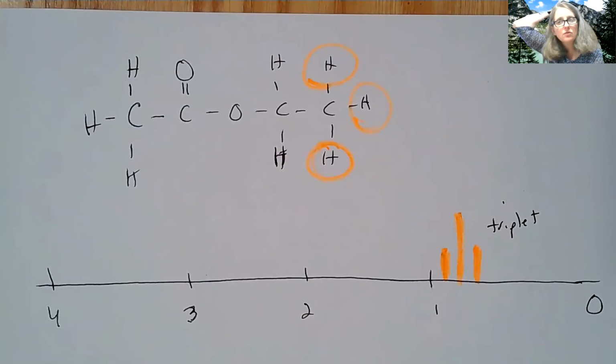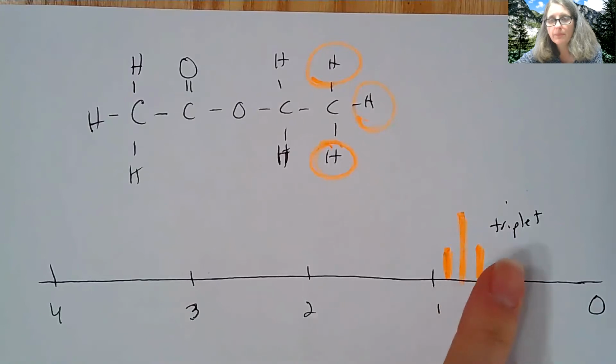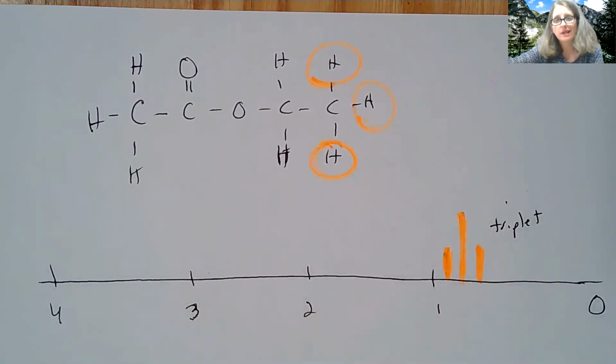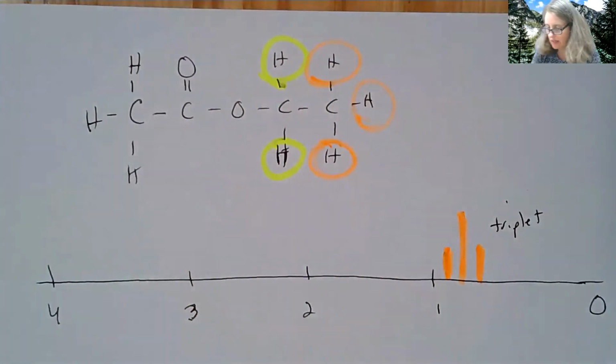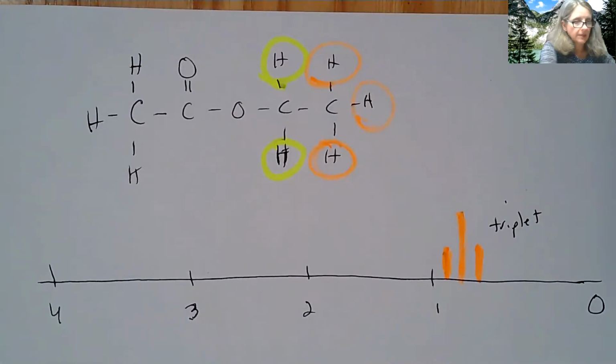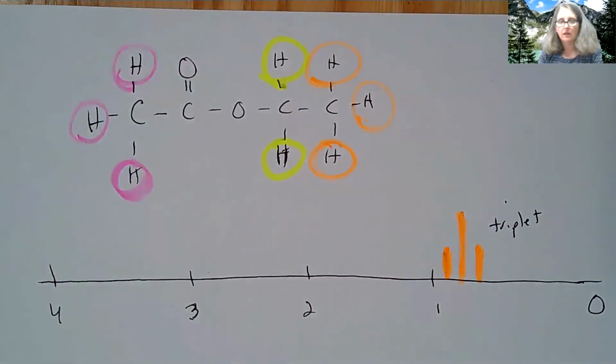And when we're doing these drawings, and I'll emphasize this again, draw it, but then also put next to it what the splitting pattern is, so that there's no misinterpretation when you do quizzes or tests for me, and I know exactly what you're talking about. All right, so then I have these hydrogens there as one color. Let me see if I have another color here. And then I have these hydrogens here.